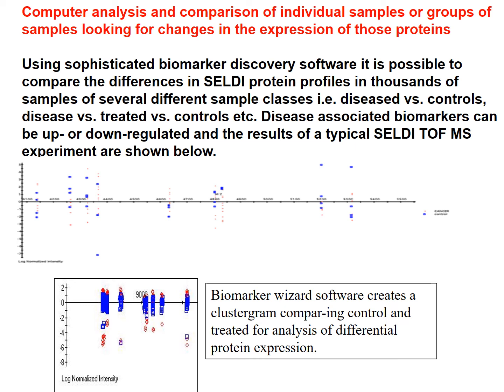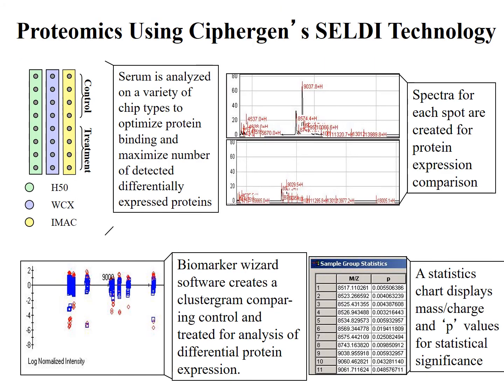And they cluster, they actually find the different proteins and see the different distributions of, or it's called differential protein expression here. So you can ask the question, what's different about multiple samples here? It's really kind of neat. So this is a real high throughput approach. So each little disk can be a patient sample there.